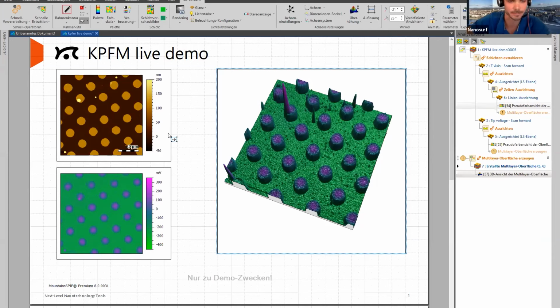Yes, definitely. Good to see something like that as well, so you're not surprised when you actually do your own measurements. So the next question: I couldn't see how much voltage you applied to the tip to zero the VDC, VAC component. How did you decide that?